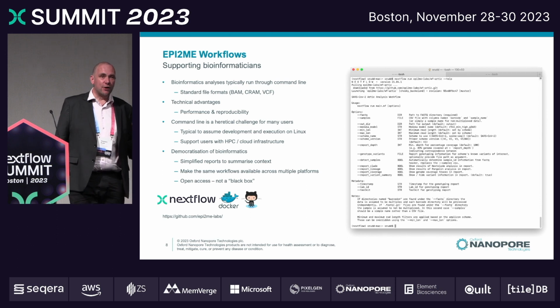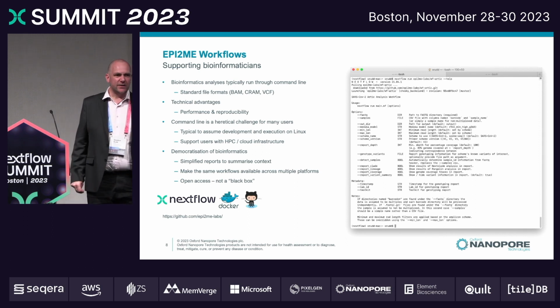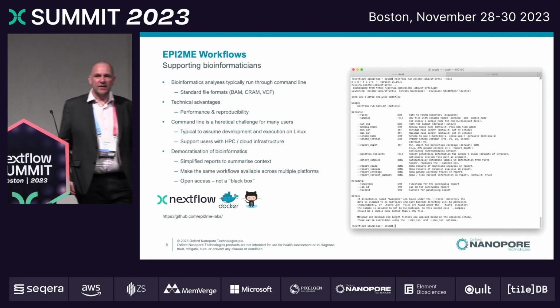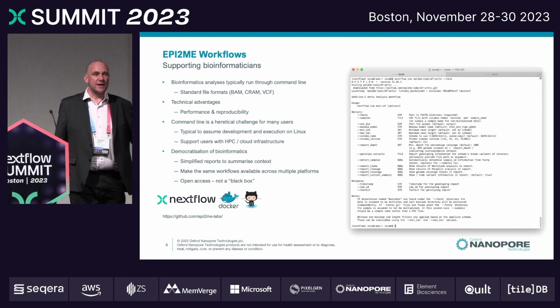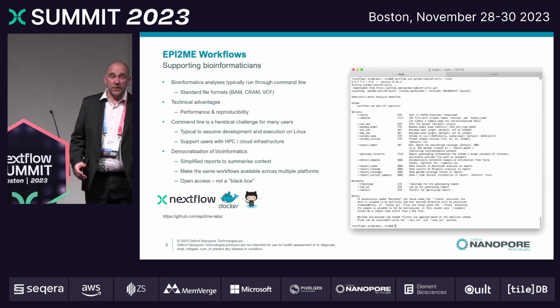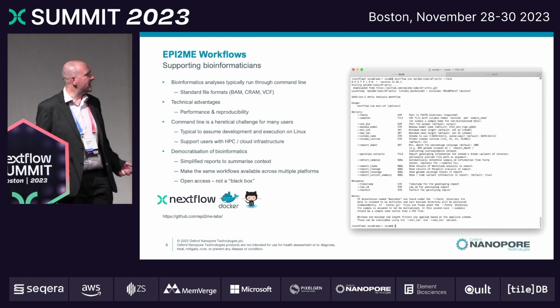We are somewhat adherent to some of the nf-core standards. We do very much like the nf-core schema. This provides us with a framework that is somewhat interoperable, but somewhat not. It's designed to be something that makes a lot of sense for our users, and it's really working towards what are the best practices. We want the code to be literate. We want to help you, the professional bioinformaticians, see how we, the nanopore experts, would recommend that you solve particular problems with the particular software environments that have been tested and validated by our own teams.